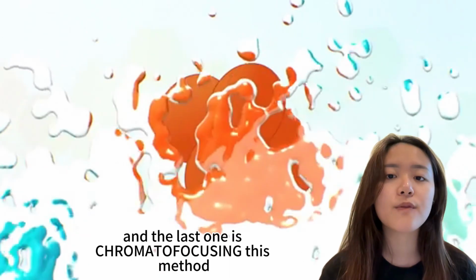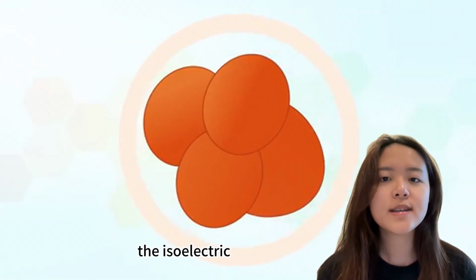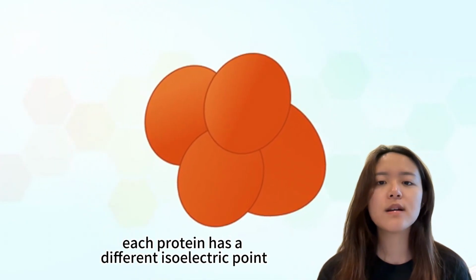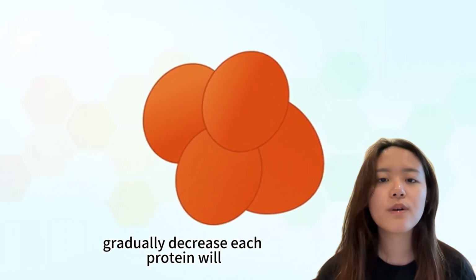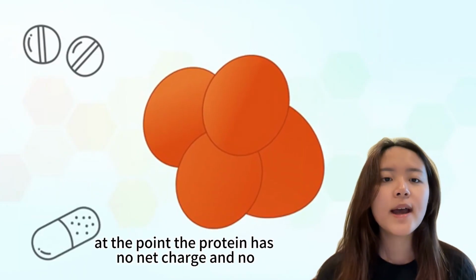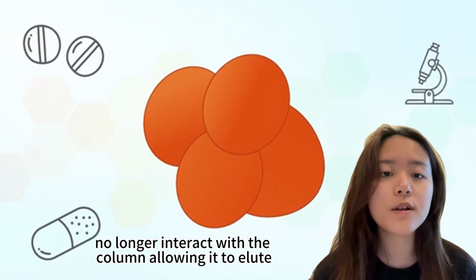And the last one is chromatofocusing. This method separates protein based on their isoelectric point using a pH gradient. The isoelectric point is a pH at which a protein has no net charge. Each protein has a different isoelectric point, so as the sample passes through the chromatography column and the pH gradually decreases, each protein will reach its specific isoelectric point. At that point the protein has no net charge and no longer interacts with the column, allowing it to elute separately.